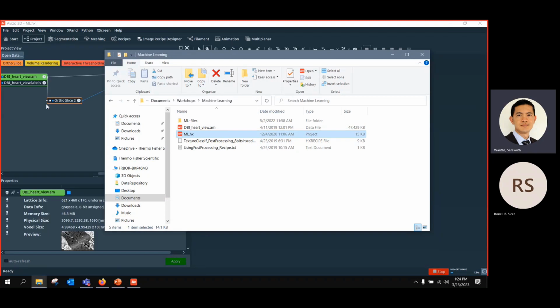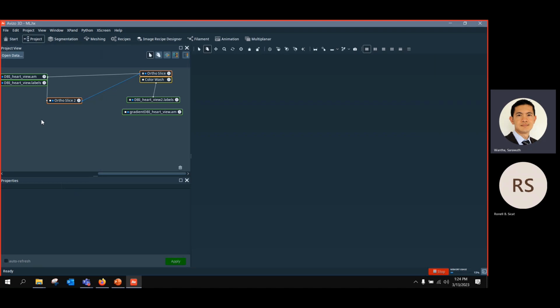One question. Yes. Is it the machine model property that you just showed? Yeah. Say, or is it going to be part of one of the pipelines?